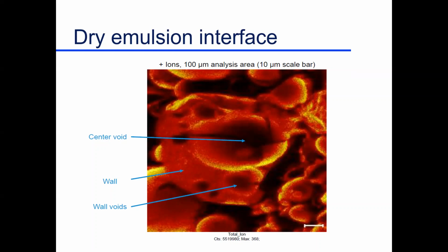I'm not quite sure how this is partitioned. Is this particle, my capsule, uniform across here? I don't know a lot about that structure, and that structure is my barrier to protection. It keeps oxygen from coming in. So I'm really interested in this wall material, the shell material, because that is my oxygen barrier to keep oxygen from destroying the flavor. So again, how can you look at the structure, how it partitions during processing and formation, by using mass spectrometry? I'm basically scanning, bombarding every part of this process and looking at the chemical composition of the barrier that's been presented.